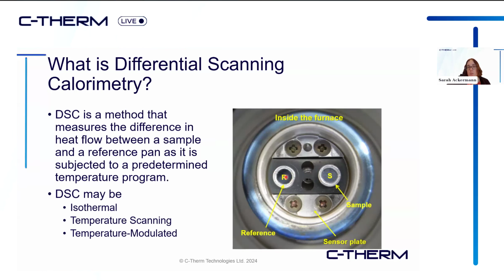There is a sample thermocouple, which is very close to the sample side. In this case, it's actually right under this little bridge here.